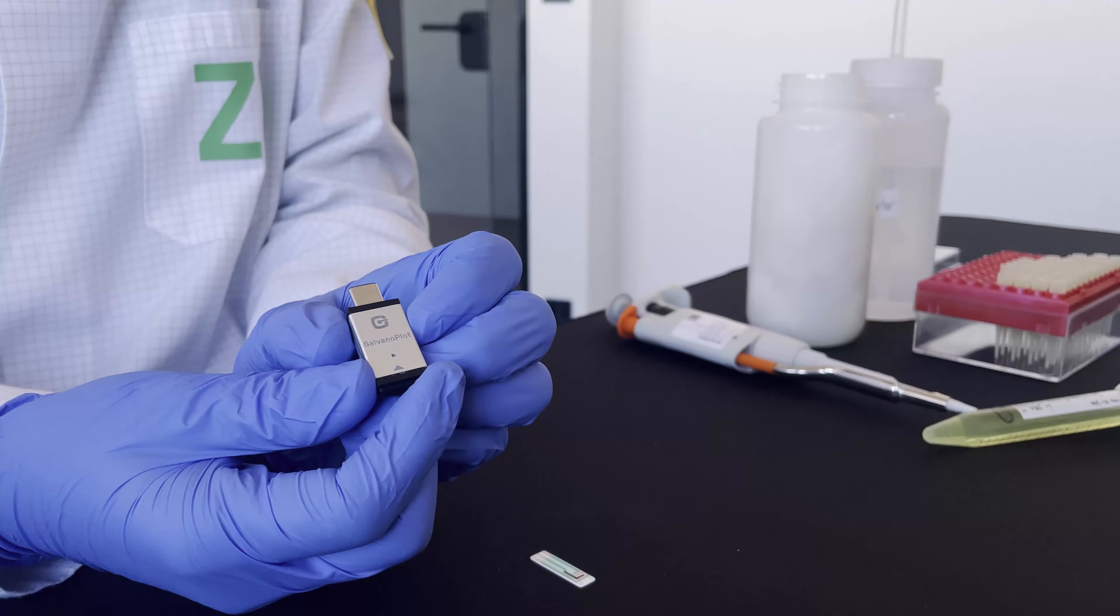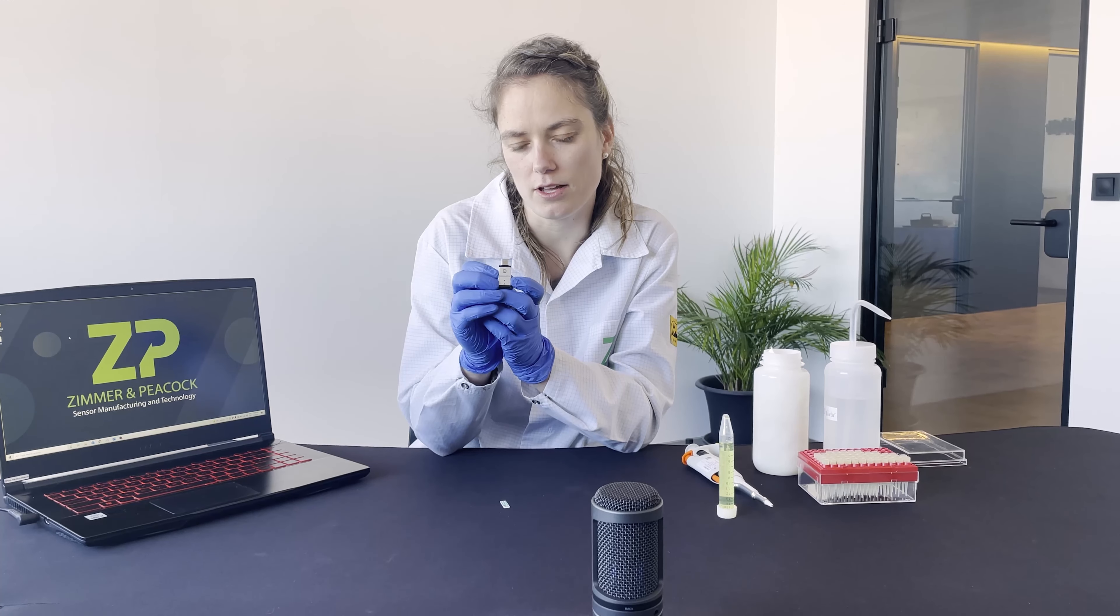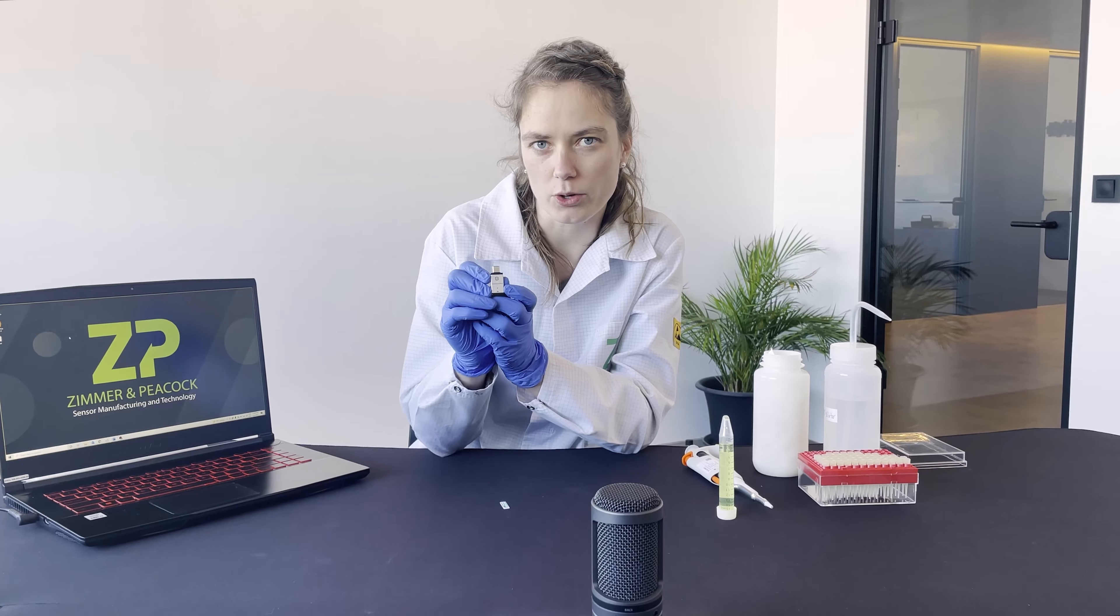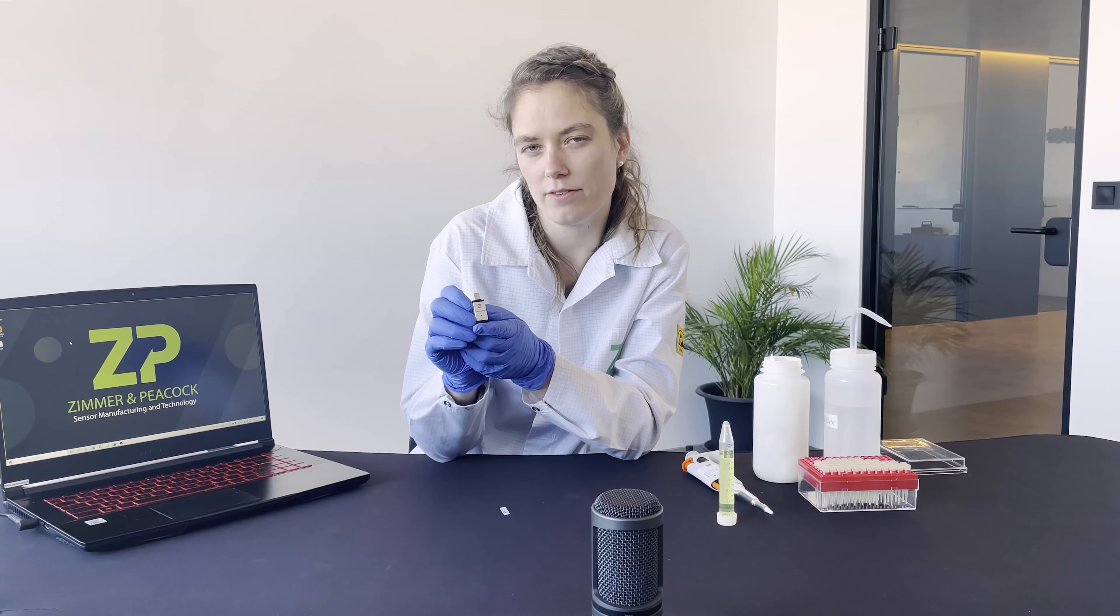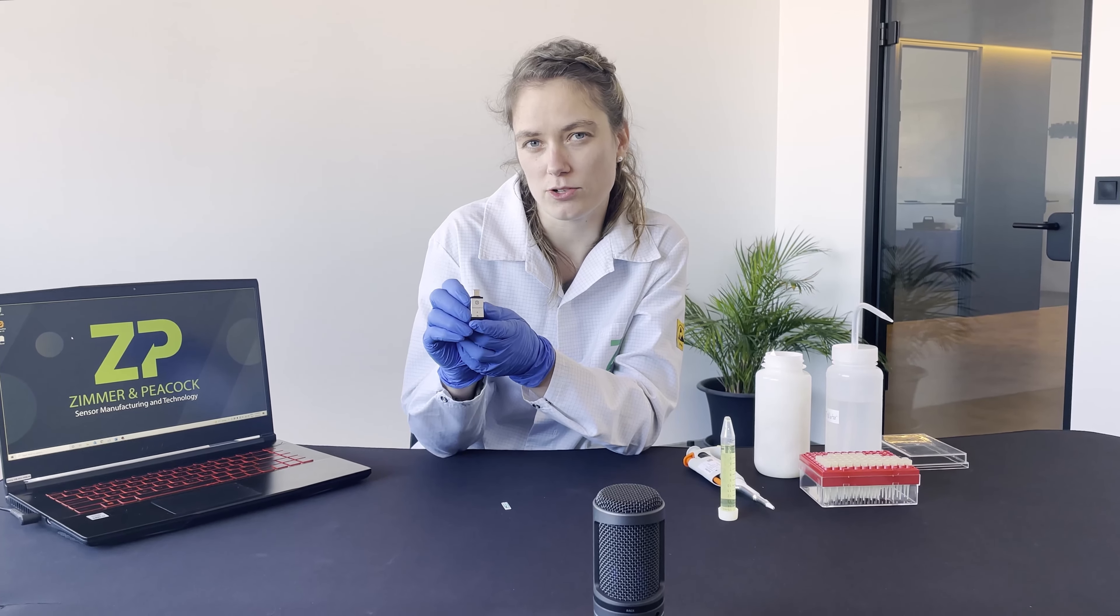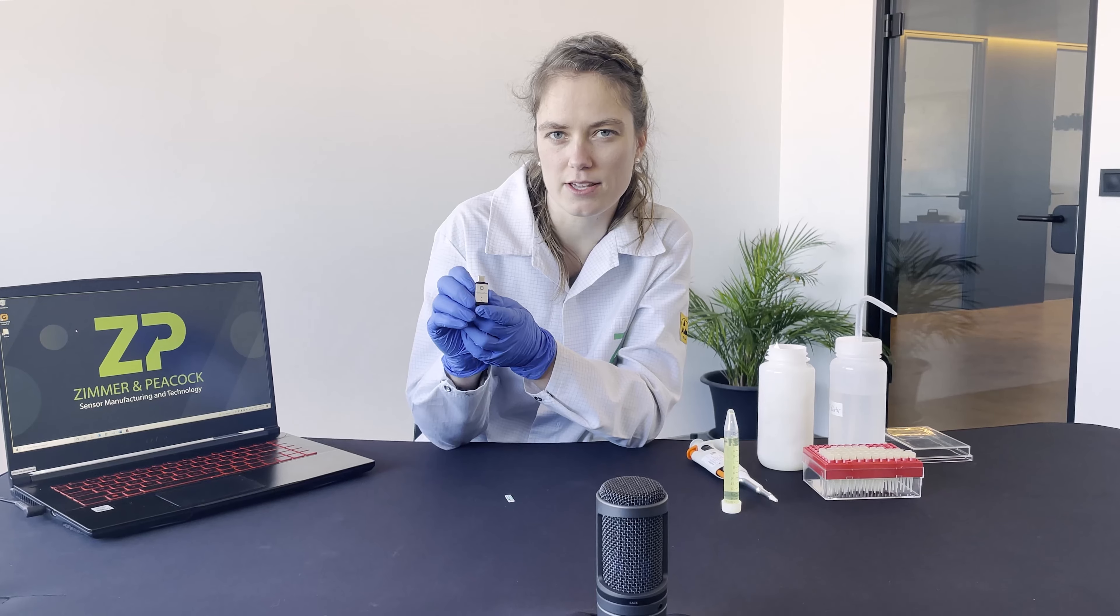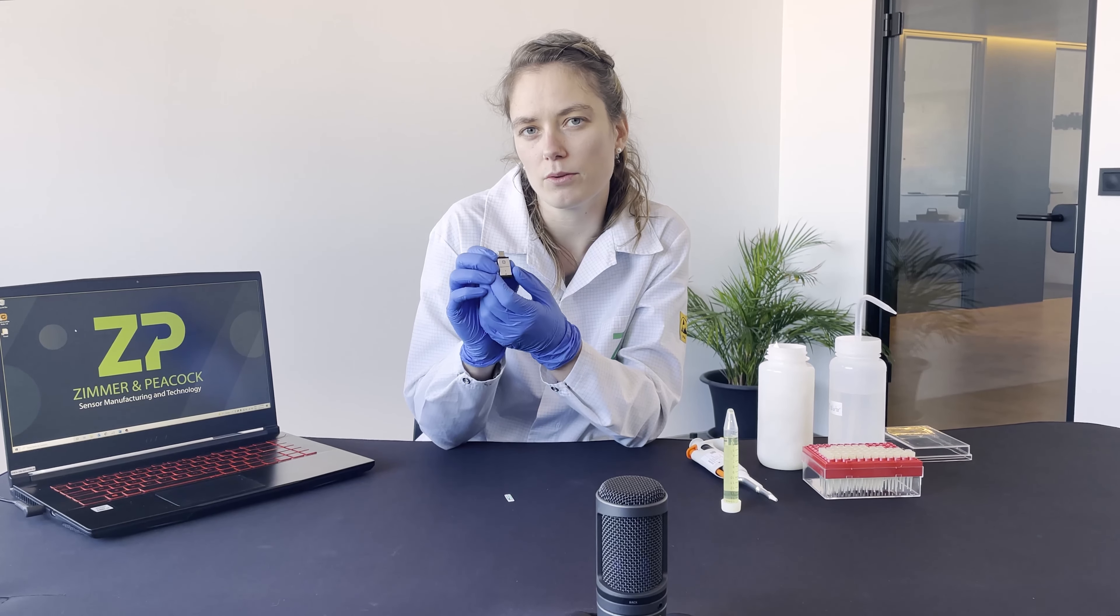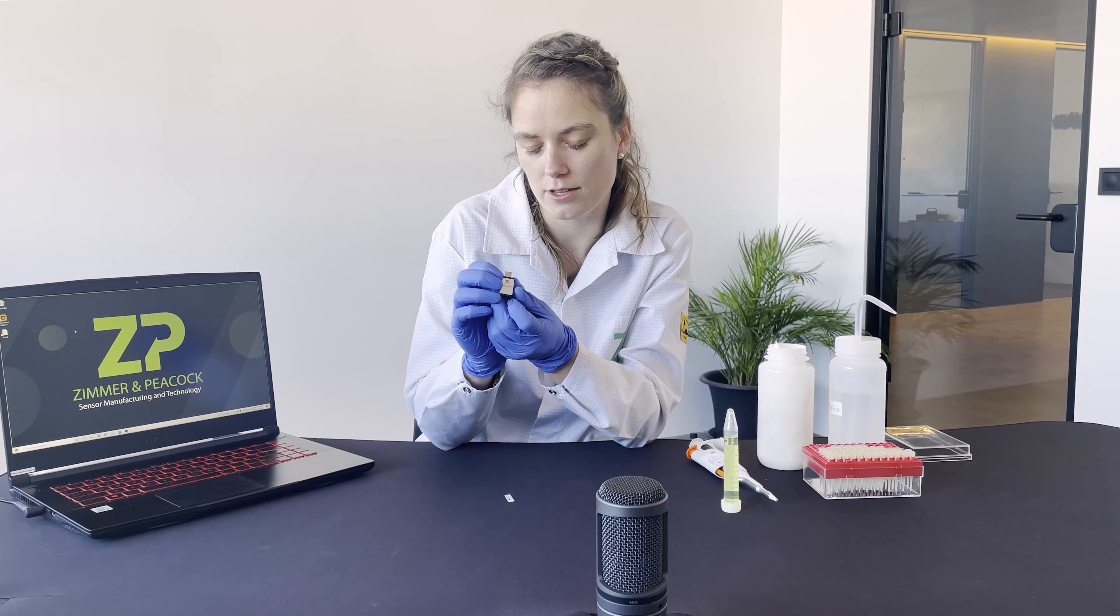This really small potentiostat is not much larger than a coin and runs amperometric and voltammetric measurements. We will be running cyclic voltammetry today.